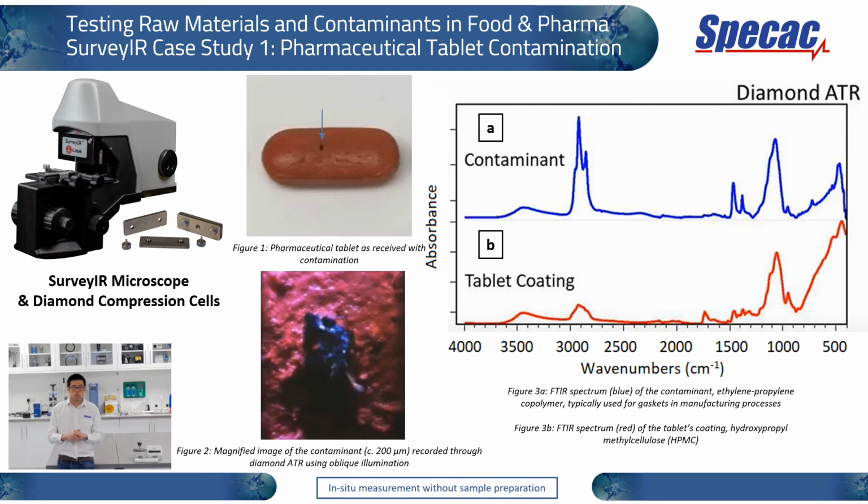By using this technique, because it's an ATR method, you're able to analyze the first few microns of the coating without penetrating into the pill to analyze the active ingredients of the pill. So you're merely analyzing the outer surface of the pill.